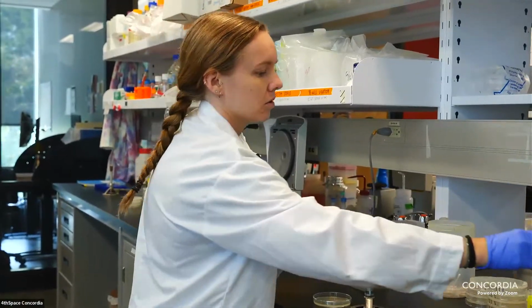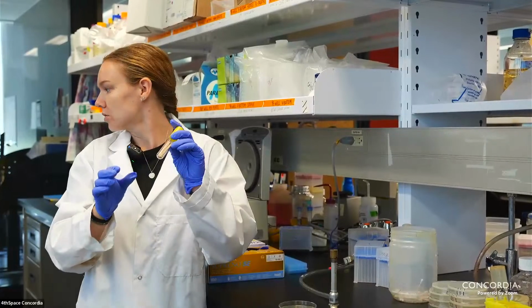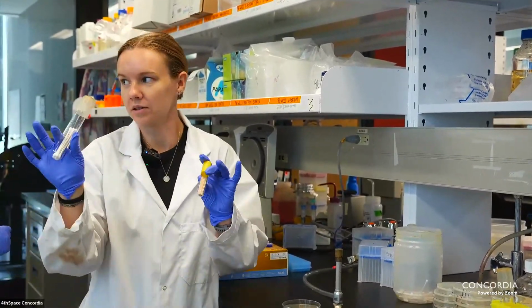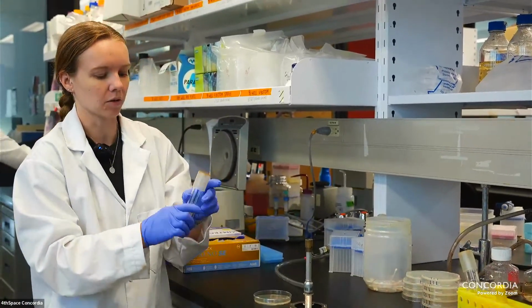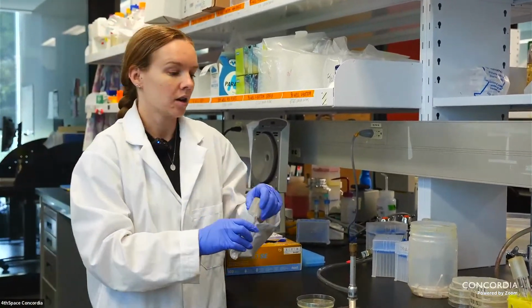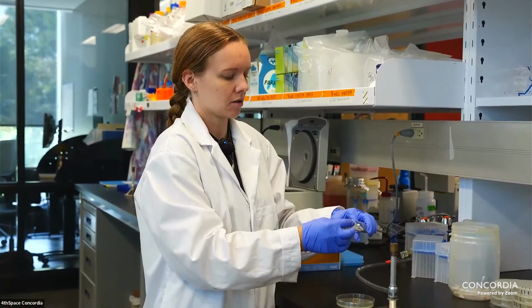We'll get you a new pack of cotton swabs, but these are the toothpicks, and these are the cotton swabs. You can pick either. Like I said, the toothpicks will be a bit more fine, and the cotton swabs will be a bit thicker. So you're going to take one out.